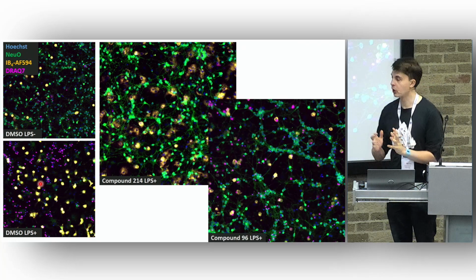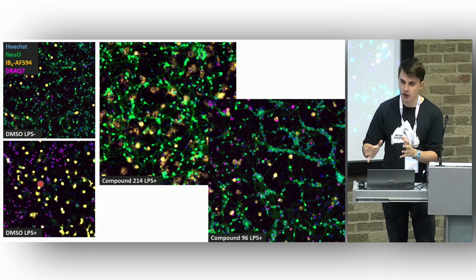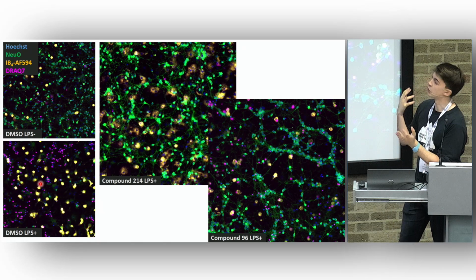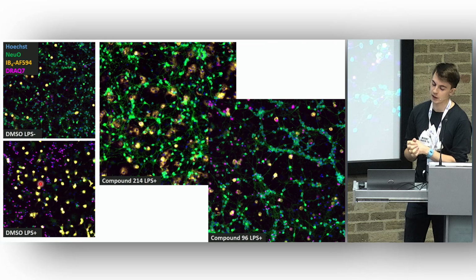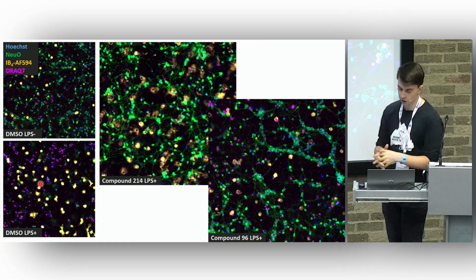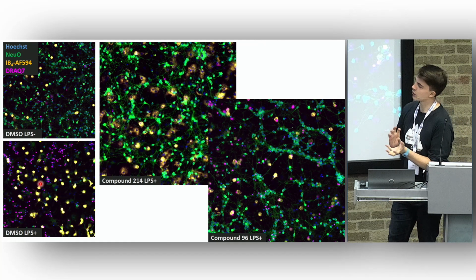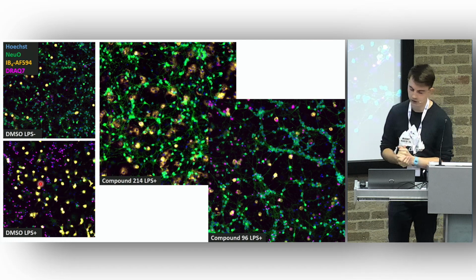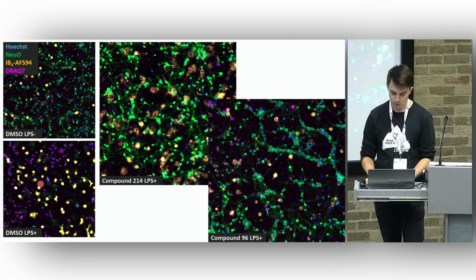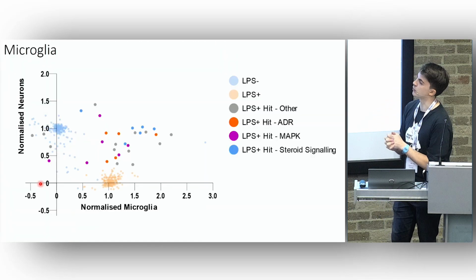What's interesting, and I want to point out on this slide, is that this is just a randomly chosen other inhibitor, and while both are producing a nice neuroprotective effect, the other stuff in the culture looks completely different. So the microglia, for example, look completely different, and there are different numbers of them, etc. So it's moving into that multicellular complexity that is hopefully one of the strengths of this type of analysis.